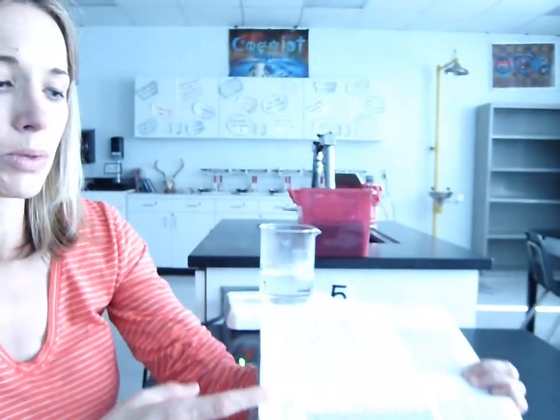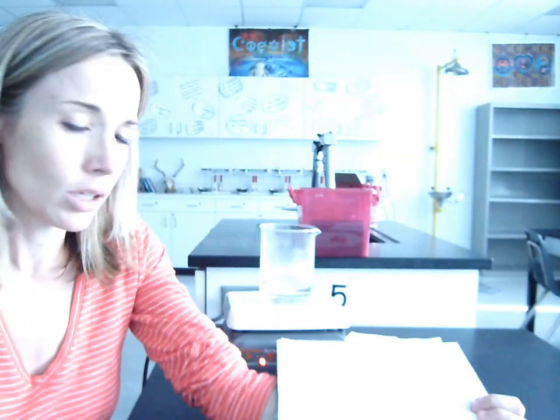So with substance B, we observed a precipitate. At a very high temperature, it was completely dissolved, and as we cooled it down, it appears that a solid crystallizes right out of the solution, and so we say that it precipitates out of solution, and then the solid is called a precipitate.